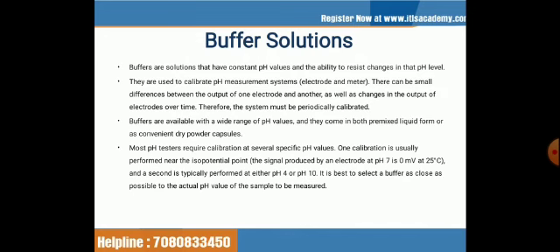There can be small differences between the output of one electrode and another, as well as changes in the output of electrodes over time. Therefore, the system must be periodically calibrated.